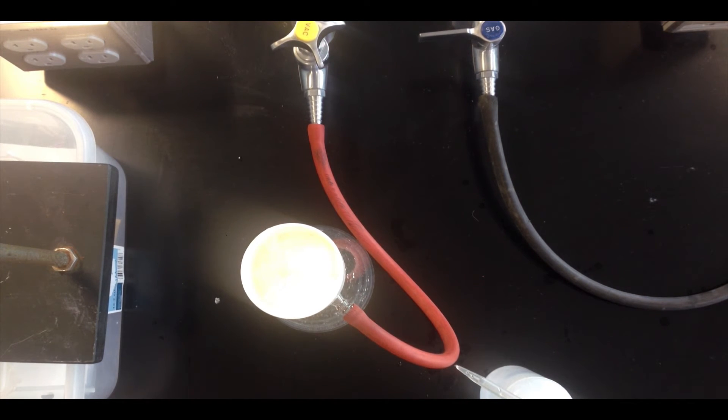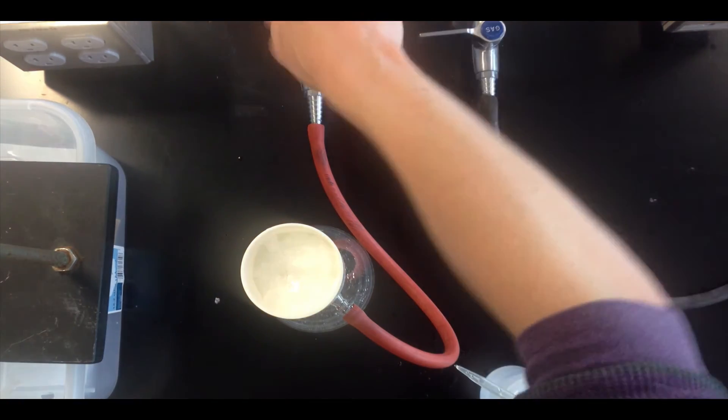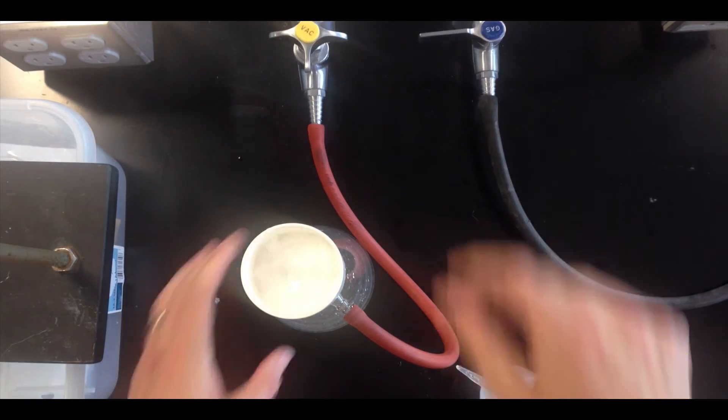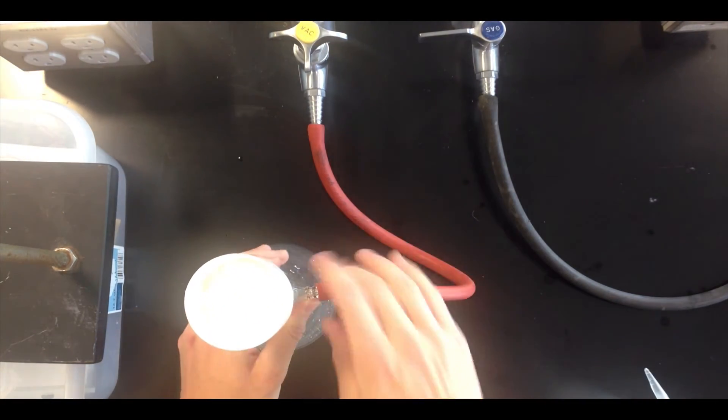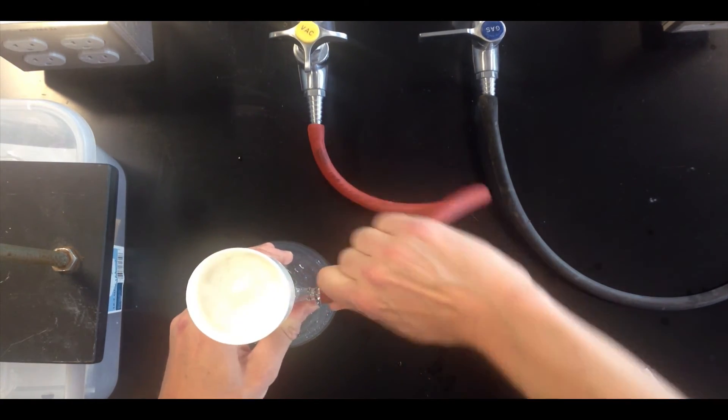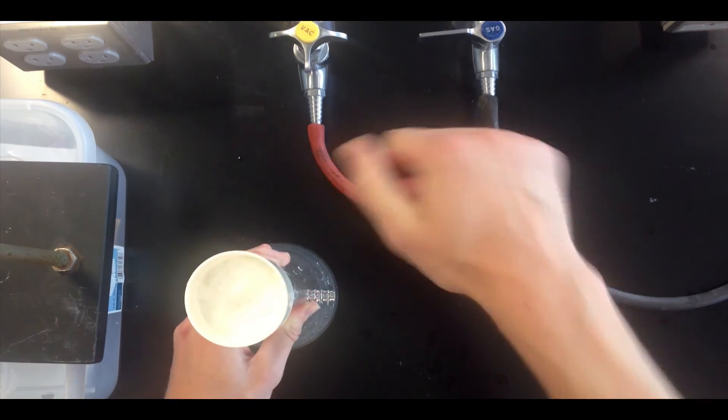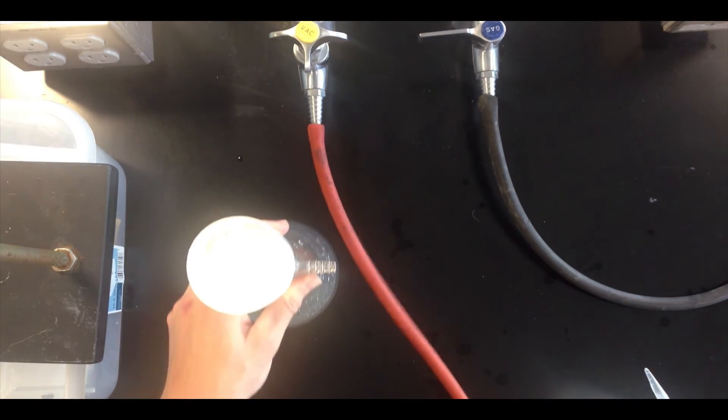That's pretty much all there is to vacuum filtration. When you're done, turn off the vacuum and break the vacuum. The easiest place to break the vacuum is probably where the sidearm meets the tubing, right here. You'll hear kind of a rushing sound when you remove the tubing, like so.